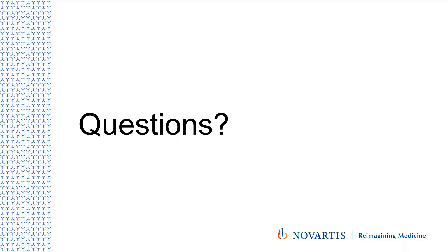Thank you. Another one here. How does the software identify non-DNA peaks? Well, this is tricky. This is very tricky. So our TOF is actually screening in a certain range of mass, something around, I don't even remember, but I think 400 to 1,200.